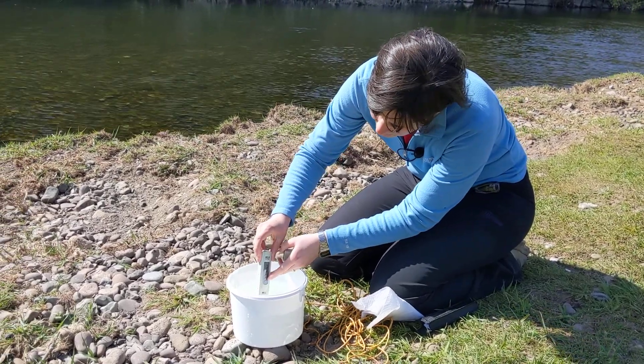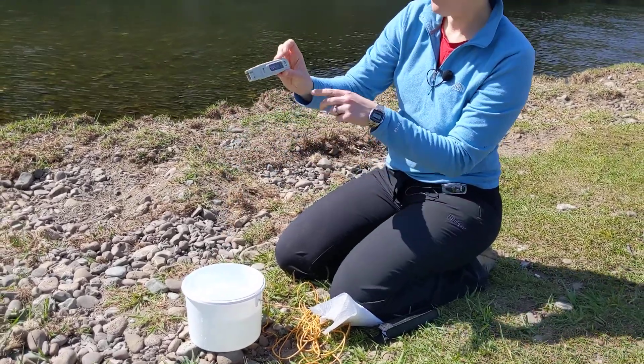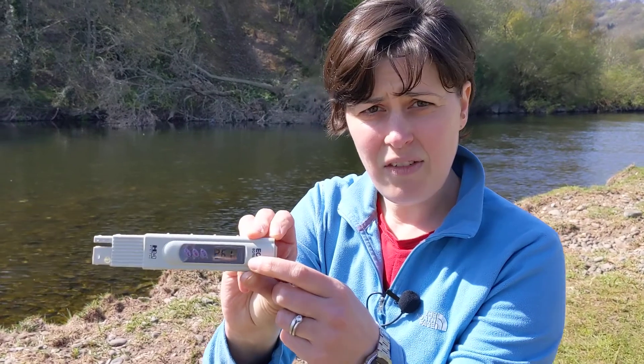You can press the hold button to hold the reading so that you can read it more easily. This reading here is giving me 261 microsiemens.